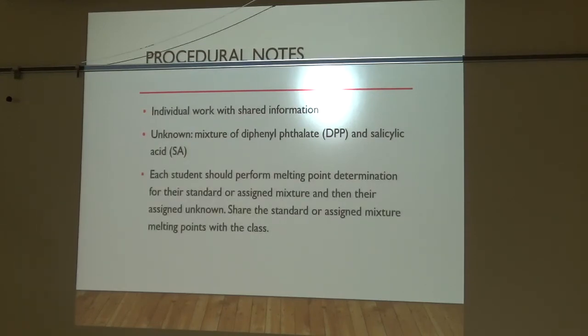Each of you should perform your melting point determination for your standard or your assigned mixture, and then your unknown as well. Share the information on the melting points of the DPP or the salicylic acid or the mixture that you were assigned with the class. Do not share your unknown melting point information. That's yours and yours alone.